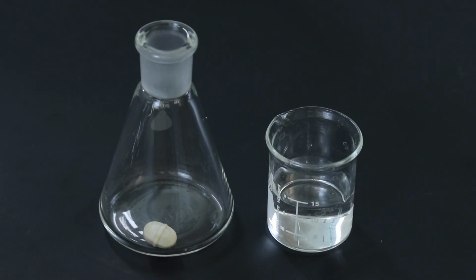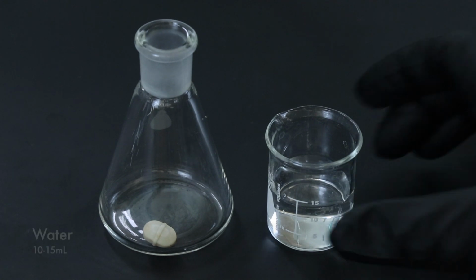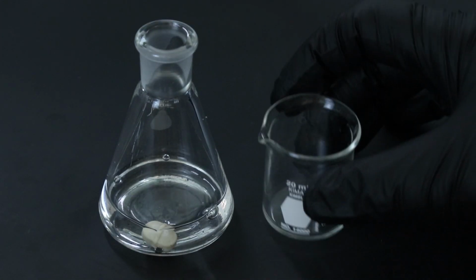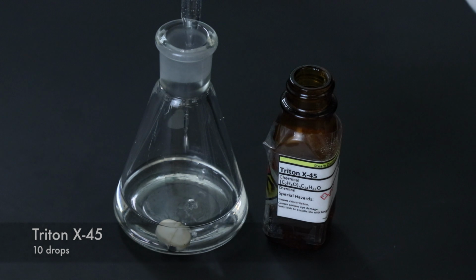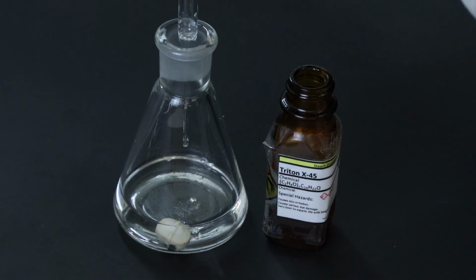Okay, here is the Erlenmeyer flask rented from the stockroom. I've already placed a spin bar inside, so now I'll add between 10 and 15 milliliters of water. Then I'll add 10 drops of the Triton X45, doing all of this before adding the cinnamon because adding the cinnamon last can help keep it from burning on the bottom of the flask initially.